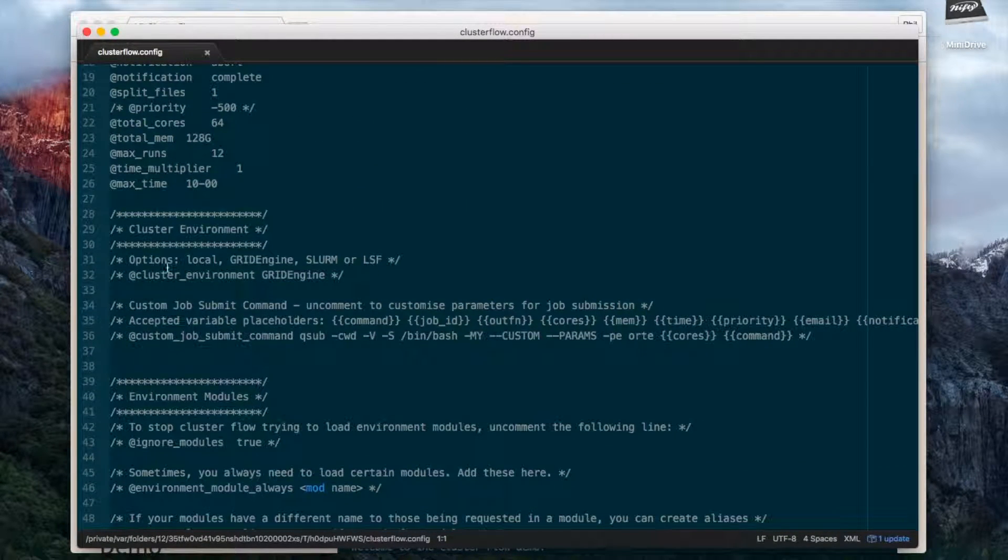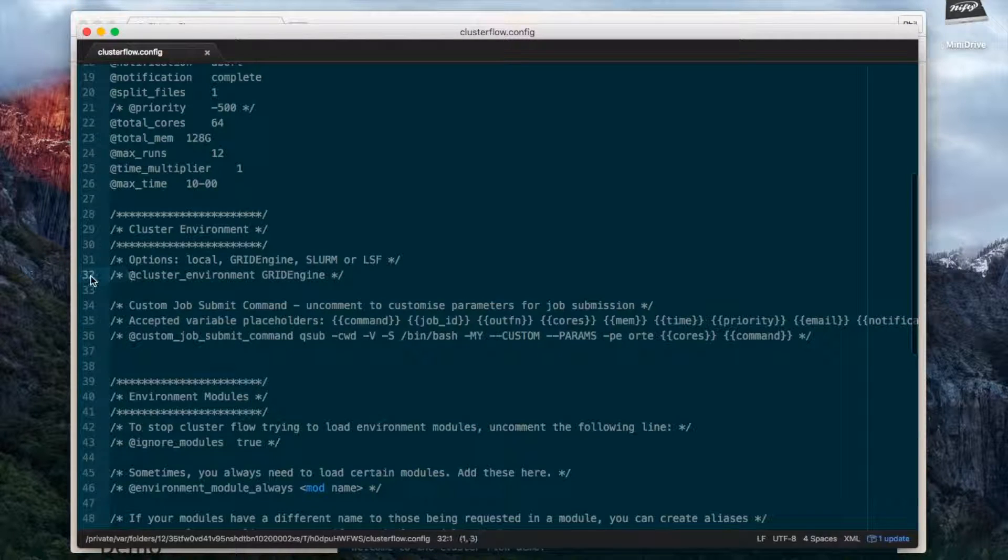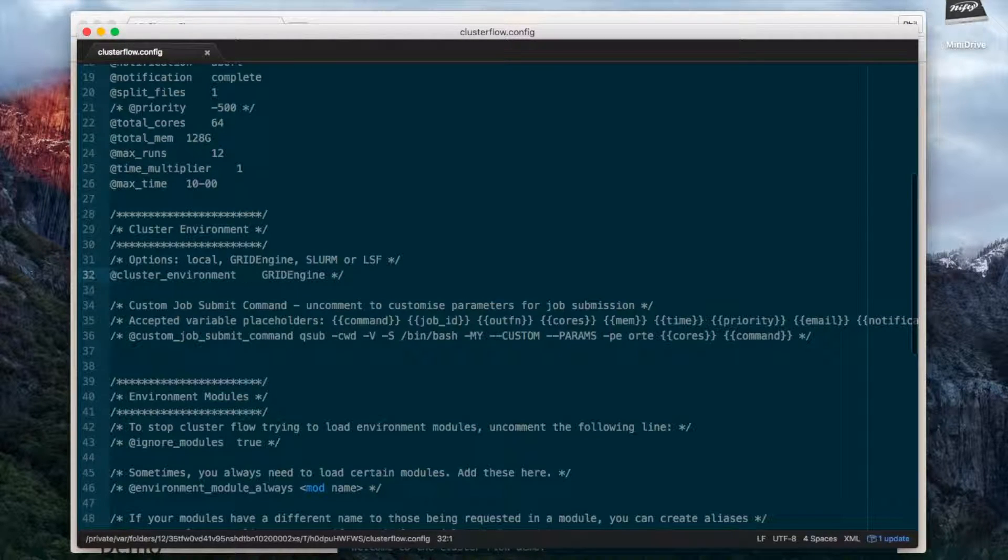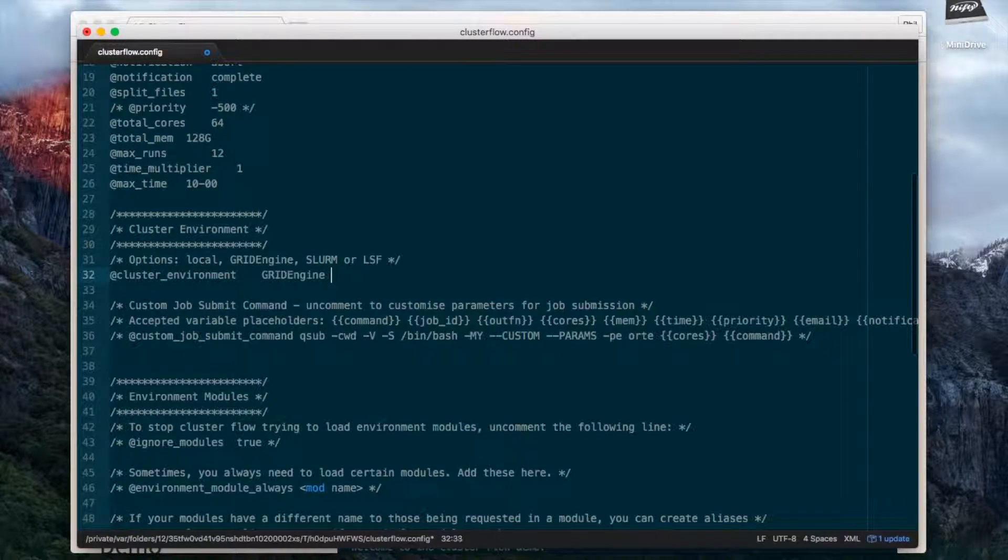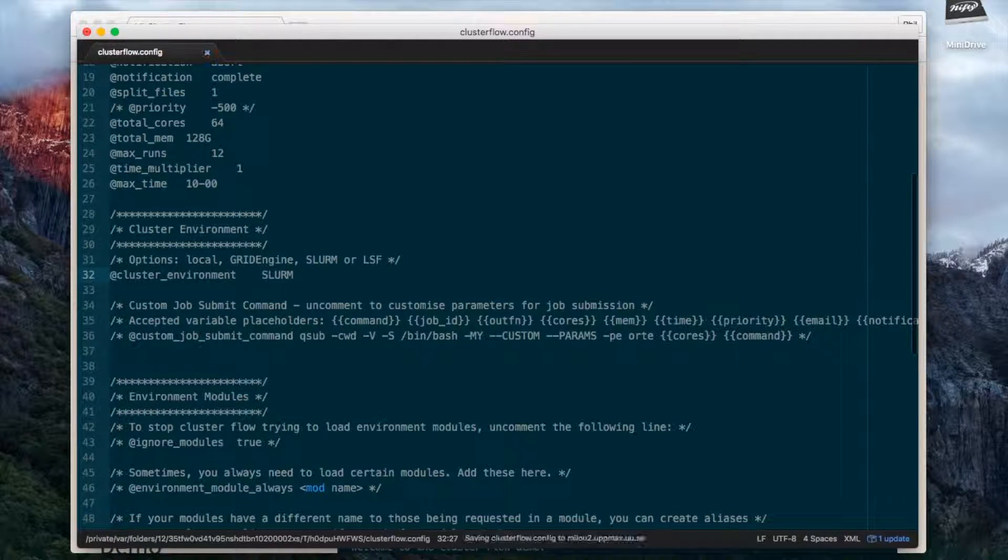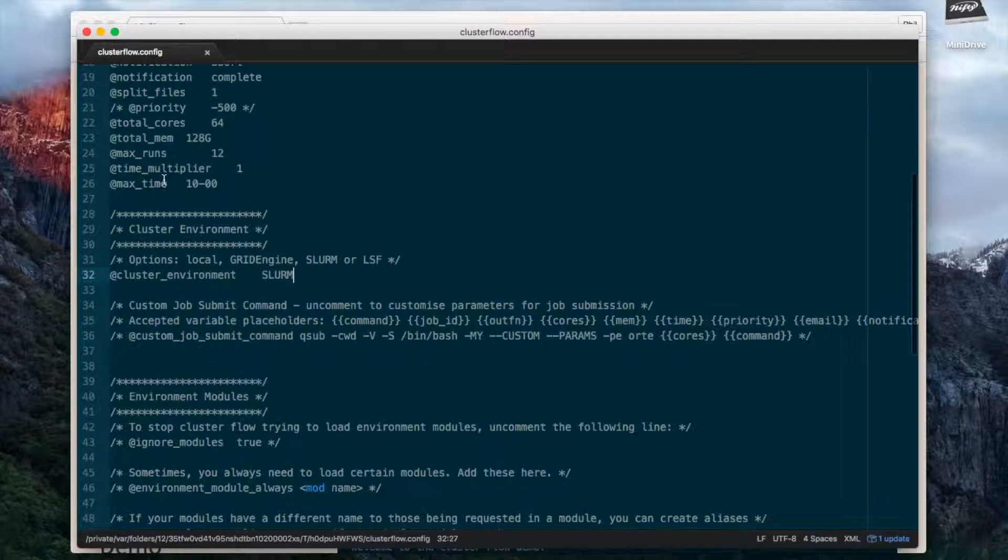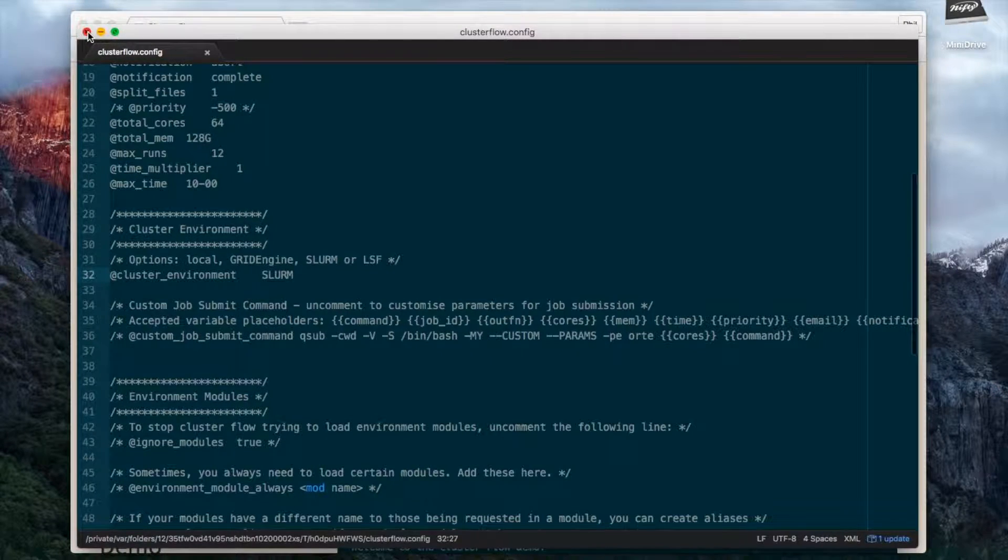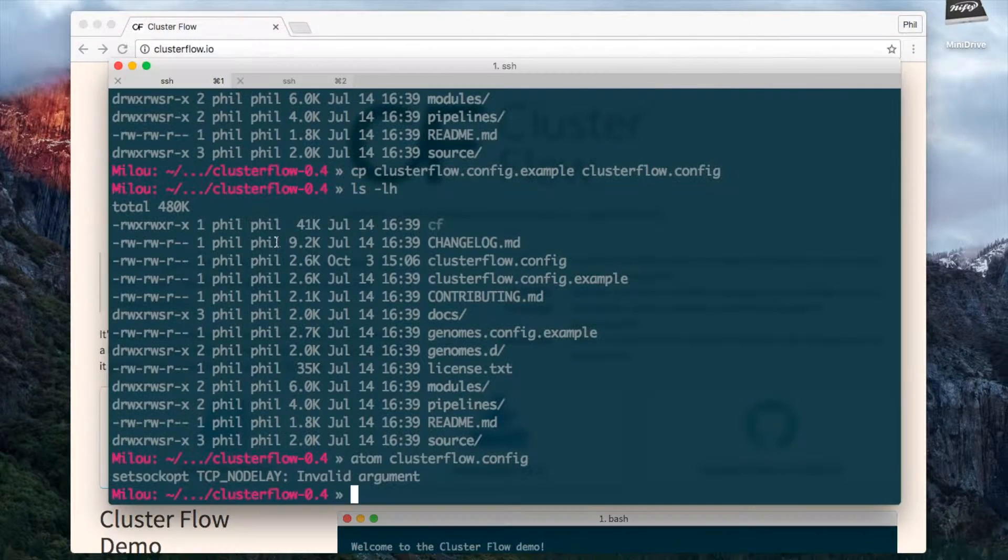The main thing I want to change here is I want to set which cluster environment I'm using. I am running on a slurm cluster so I'm going to change this to slurm and I'm going to save. That's the main thing I need to do.